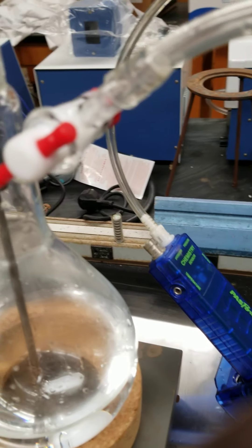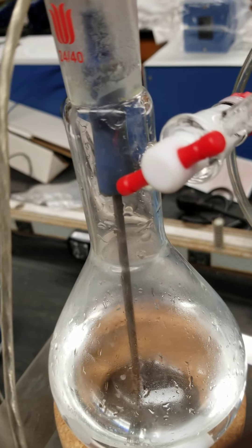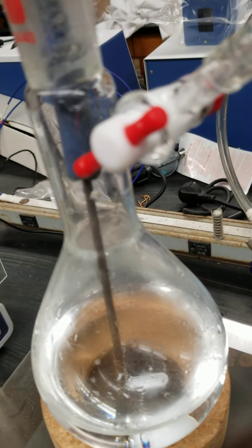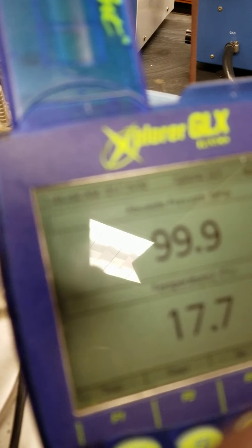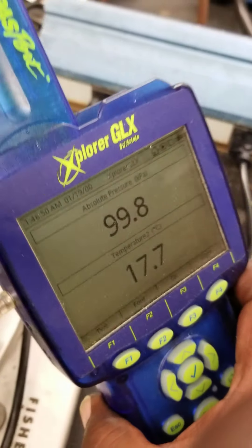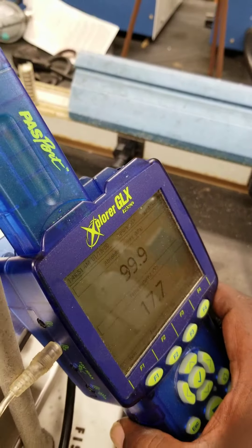Let's check the initial values. The initial values are: pressure 99.9 kilopascals, temperature 17.7 degrees centigrade.